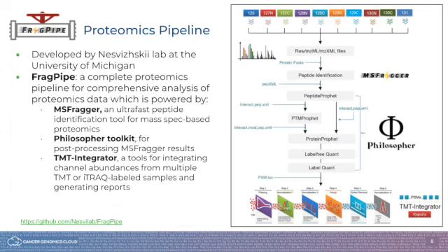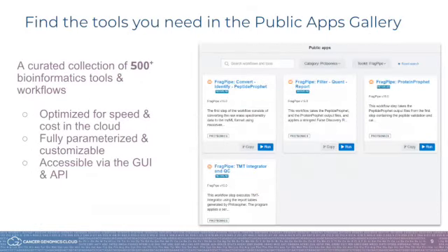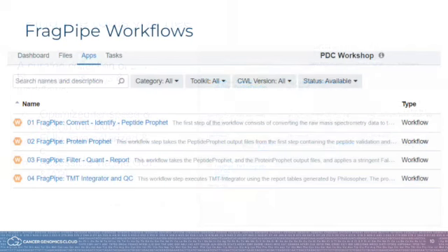All of these tools and more can be found in our public apps gallery just by searching FragPipe or any protein-related keywords. I think if you type protein, it comes up. Today, we'll be using 4 workflows in our FragPipe protein analysis, as you can see right here.